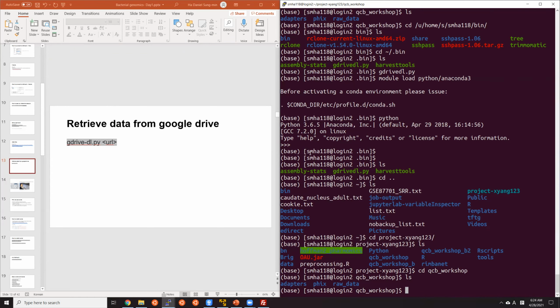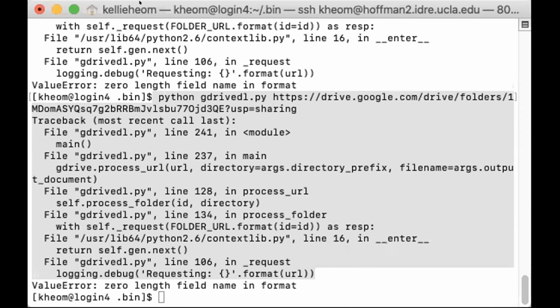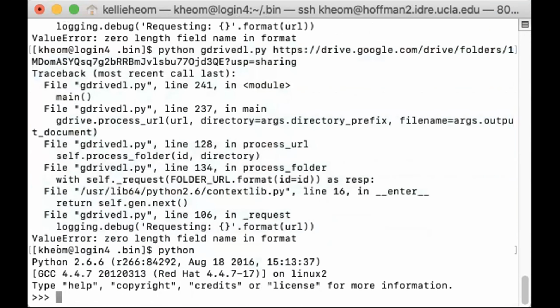It might be easier if I share my screen. Would that be possible? Sorry, everyone. Can you enable me to share? Yeah, go ahead. I think it's a version issue. Can you type in Python on that screen? Oh, that's why. I changed it before.